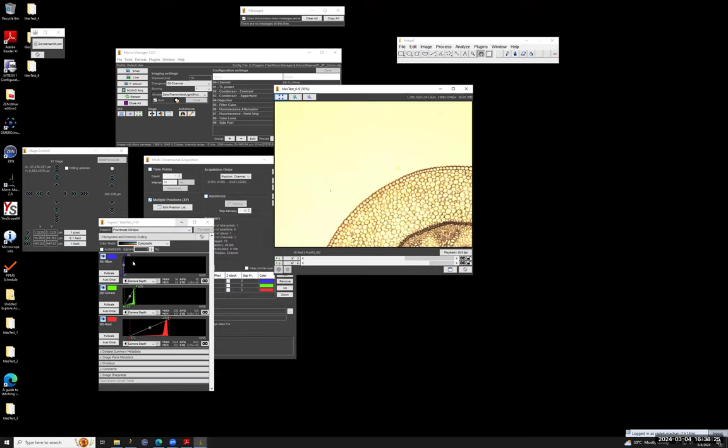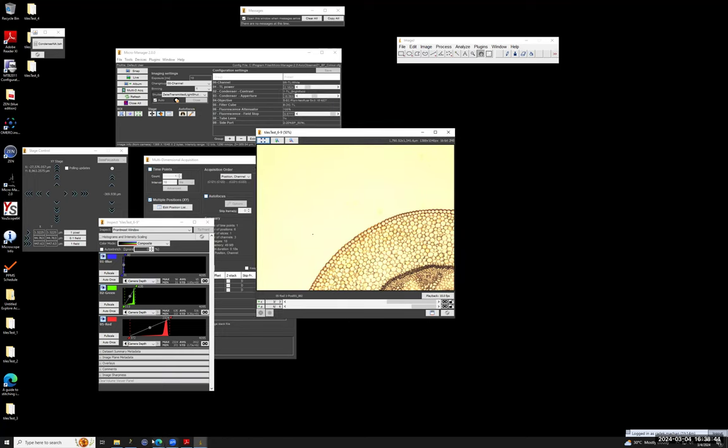And well, I could have changed the exposure times here. Changing the exposure times is basically doing white balance, so that I change them to approximately match their histograms. Then I can again stitch them.